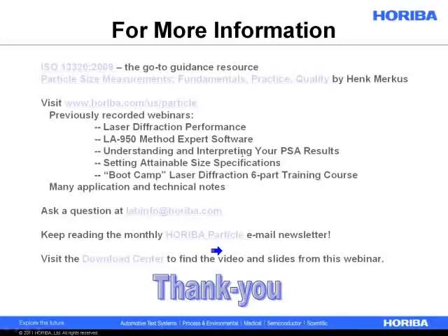But there's nothing about laser diffraction, the physics of it, the mathematics of it, that prevents us from resolving differences in discrete size distributions. Typically, we say that it needs to have a 3-to-1 size difference. So if you have a 300 nanometer distribution and a 900 nanometer distribution, it should be able to pick out the differences.